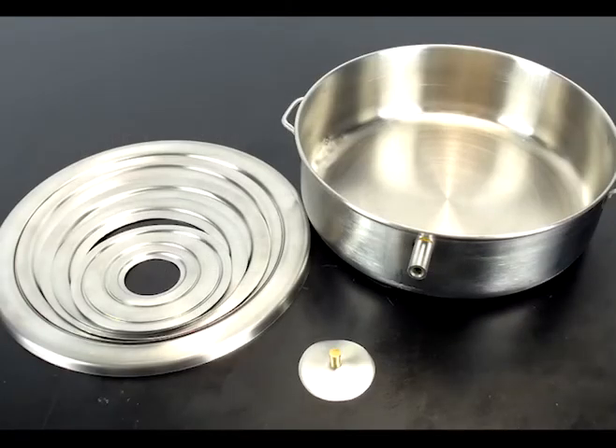This stainless steel hot water bath is a perfect addition to your laboratory where you need to maintain a constant temperature. The stainless steel pan is 8 inches in diameter and 2 and 3 quarters inches deep. It has two handles on the side to make it easy to pick up, and a nozzle on the side for steam to escape.